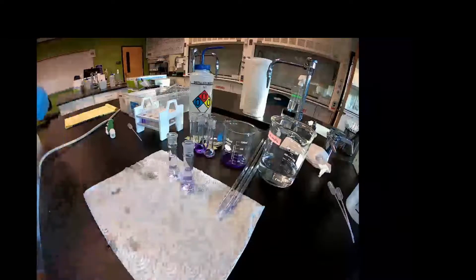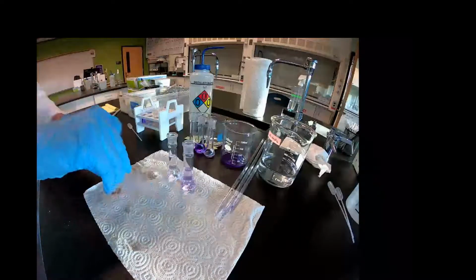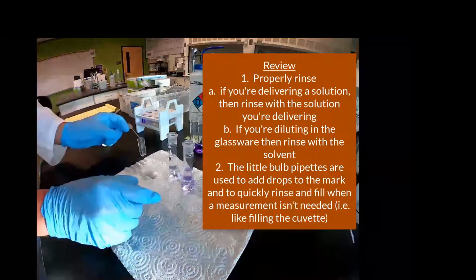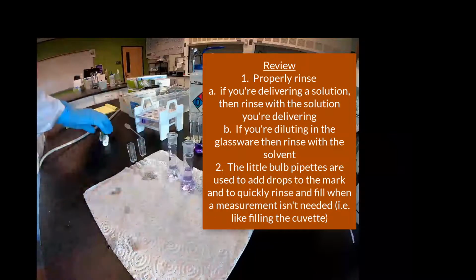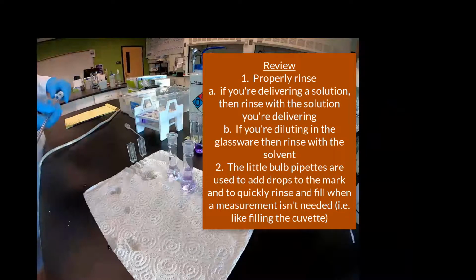So now we have the solutions. We're going to put them in the proper cuvettes. Again, for that, it's really great to have those throwaway pipettes, because you just pull up a little bit, rinse, and then use them, and away you go. No need to use those volumetrics.